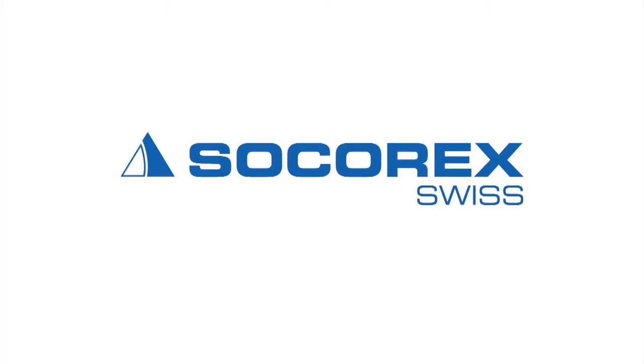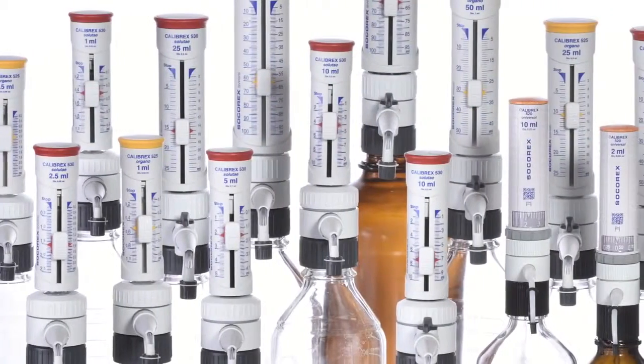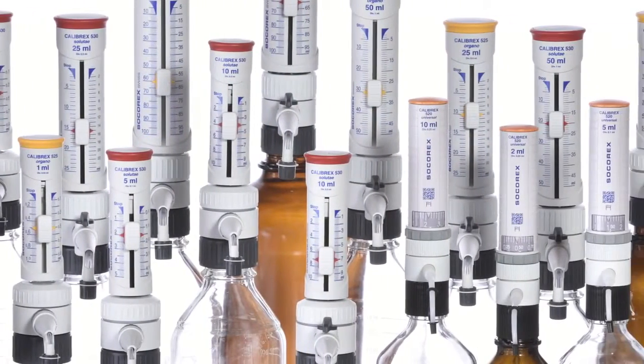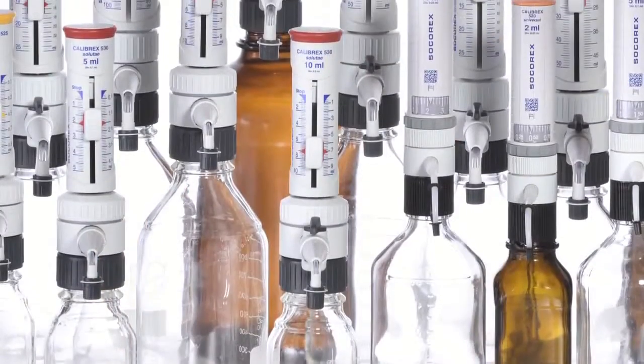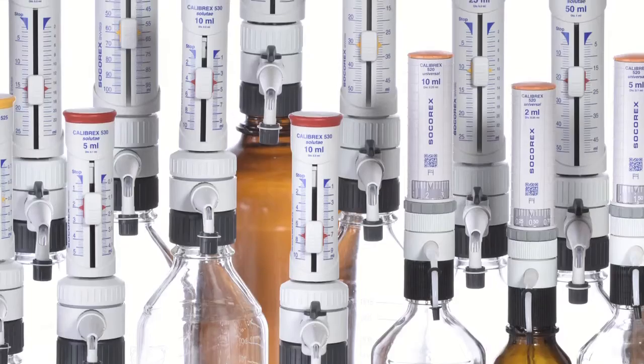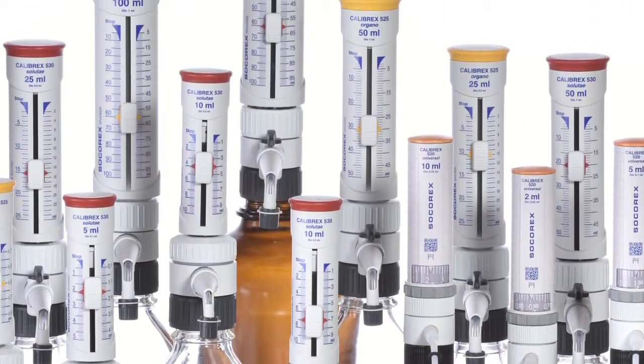Socorex Calibrex Bottletop Dispensers. This dispenser line includes a large selection of robust dosing instruments intended for safe and reproducible liquid distribution in volumes ranging from 0.1 milliliters to 100 milliliters.